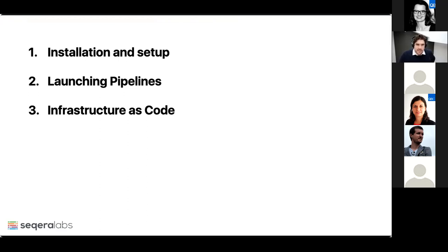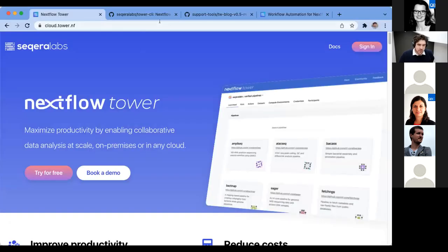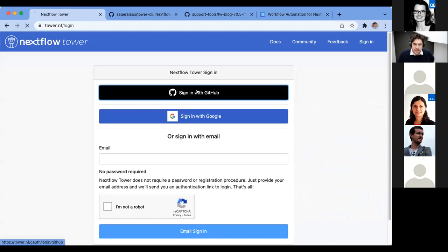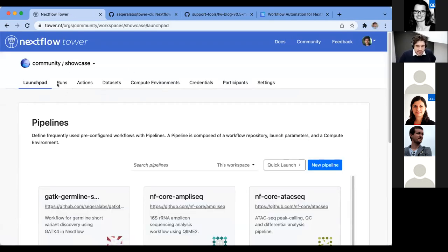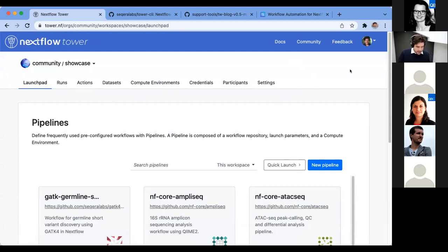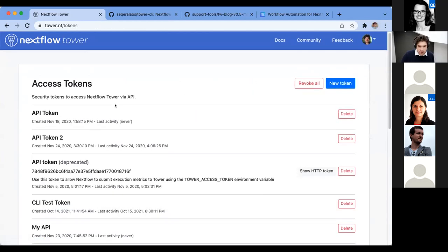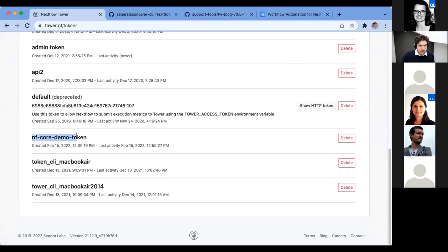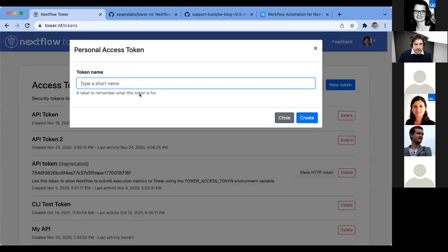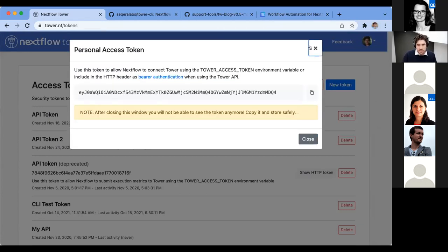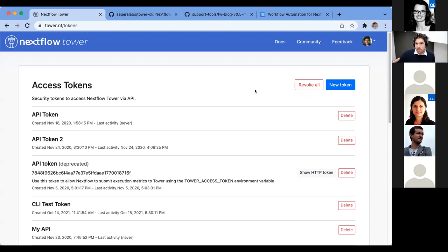You can go to cloud.tower.nf. When you log in, you've got your credentials — typically people use GitHub or Google to log in. The first thing you have is the community showcase. The CLI connects to Tower via your token. You can create as many access tokens as you want. You can see I've created a token for the NFCore demo here. When you create a token, it gives you that key.